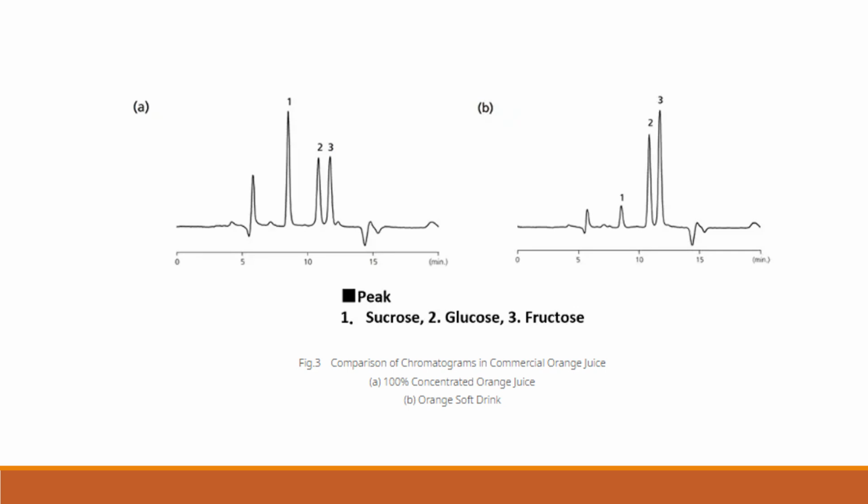Now this method requires sufficient column separation because of the poor selectivity and sensitivity of the compounds that can be detected. Furthermore, it is easily affected by any kind of temperature change or pressure change in the surrounding. The RID detector shows small sensitivity differences depending on the target compounds. Now this feature affords a rough abundance proportion of sample components, so the RID is commonly used in GPC analysis for calculating the molecular weight distribution.